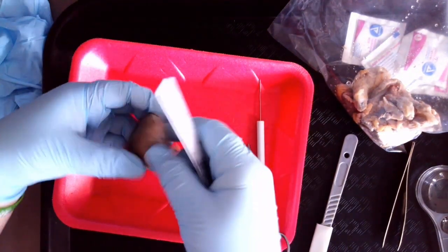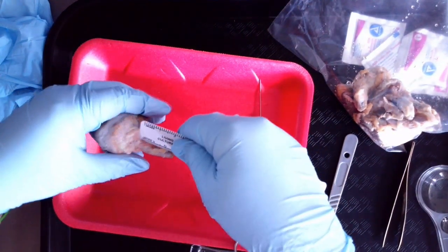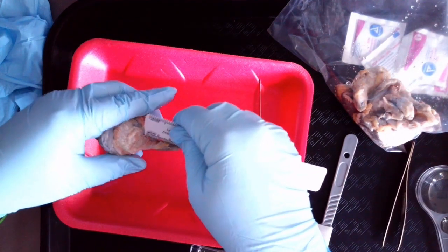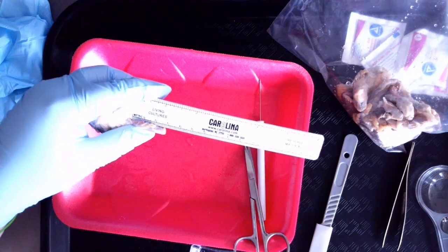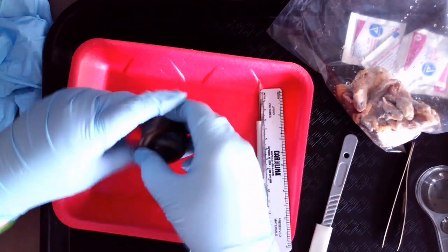The second measurement you're going to take is how much of the optic nerve was preserved. You're going to measure from where the optic nerve is coming out of the posterior of the eye and how far across it goes. You're going to get that measurement for your eye.